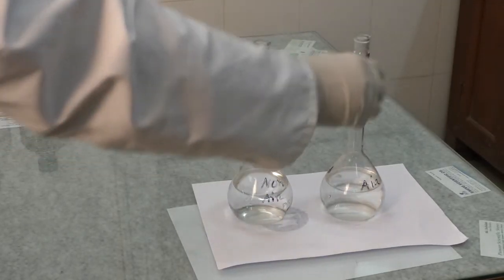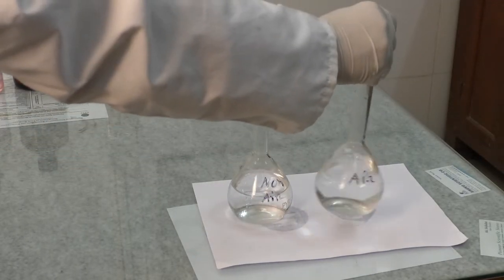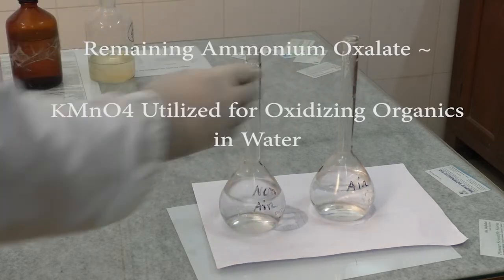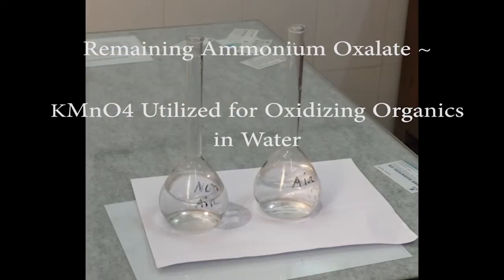Ammonium oxalate will first react with the remaining potassium permanganate in the solutions. After that, the quantity of ammonium oxalate remaining in the flask will be equivalent to the potassium permanganate that has been used during the oxidizing process of organic waste, that is, to oxidize the organic matter.